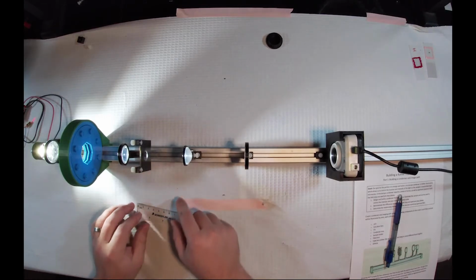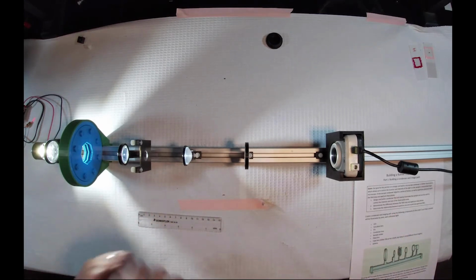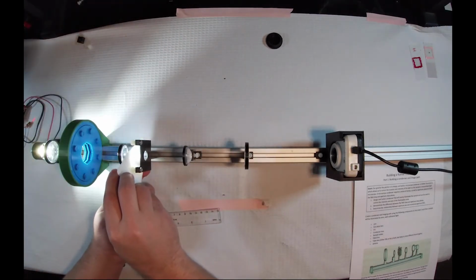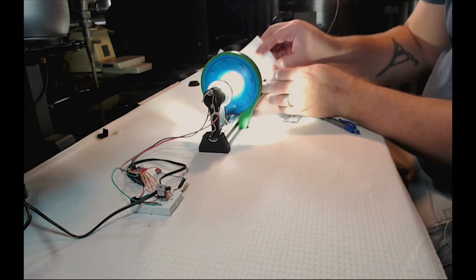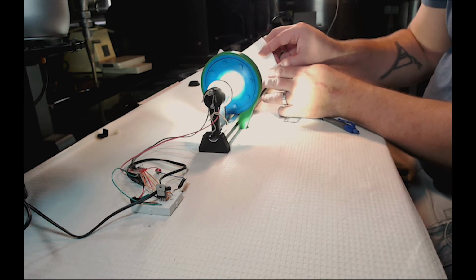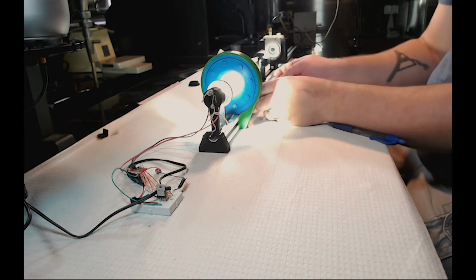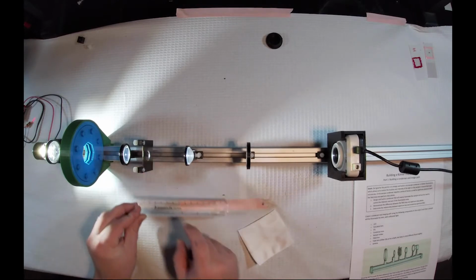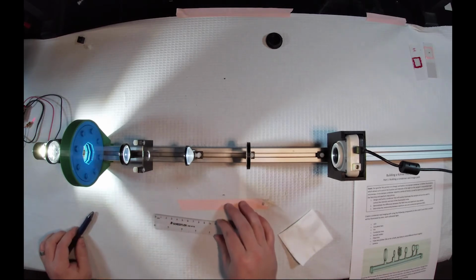Right. And that looks about good to me, but one thing that I will check is just to make sure that we have a nice focused beam of light at that plane, because again, that's what the condenser does, is it delivers our rays from our collimated LED onto our sample plane so that it's nice and even. That looks good to me. So we have our sample plane mounted one focal length away from our condenser.